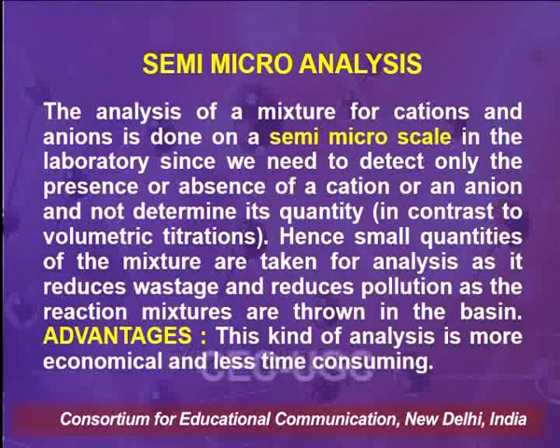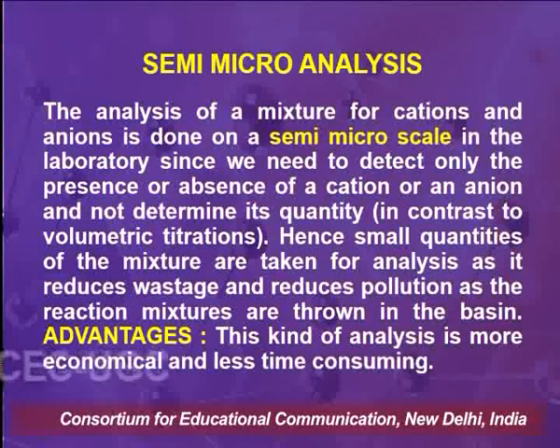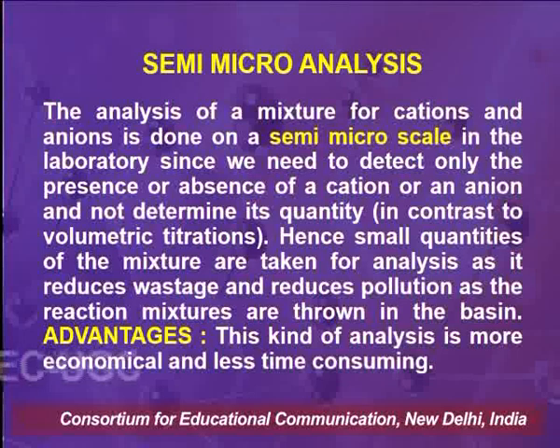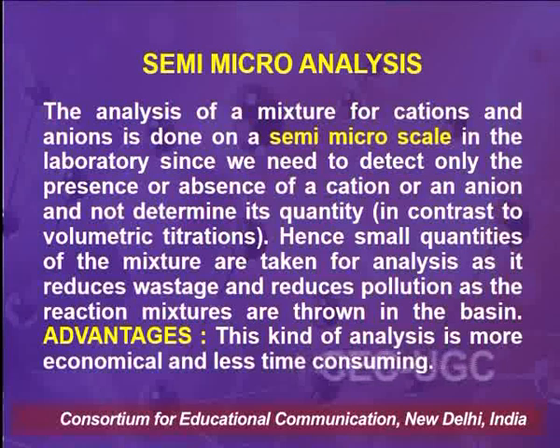However, in qualitative analysis, or as we say salt analysis or mixture analysis, we are detecting only the presence of the ions. Hence, even small quantities of the mixture can be analyzed, as it reduces the wastage and also reduces pollution as the reaction mixtures are thrown in the basin. The advantages of semi-micro analysis are that it is more economical and less time consuming.